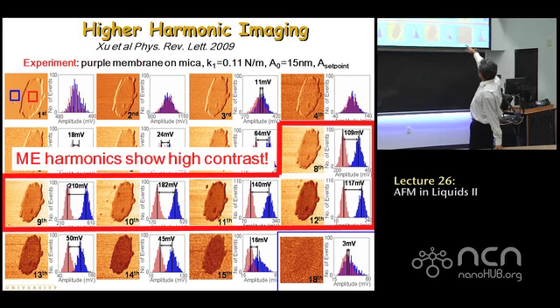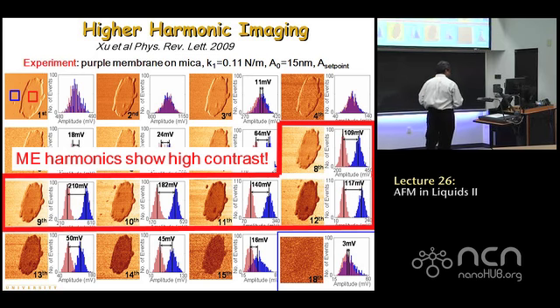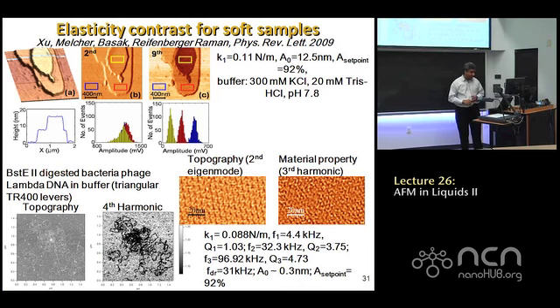The key point, of course, is that if you look at these harmonics, somewhere from the 8th to 11th harmonics, they start showing a lot more contrast. And not surprisingly, brighter here means more ringing, greater harmonics, this 8th harmonic, 9th harmonic. The darker part means it's not ringing as much. So in these specific higher harmonics, softer means darker and brighter means more ringing, basically. And you can play around with this and try different kinds of samples.